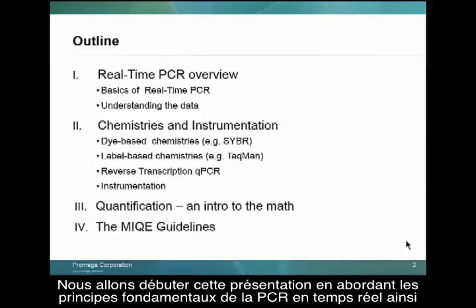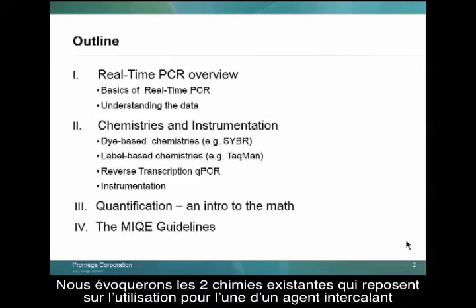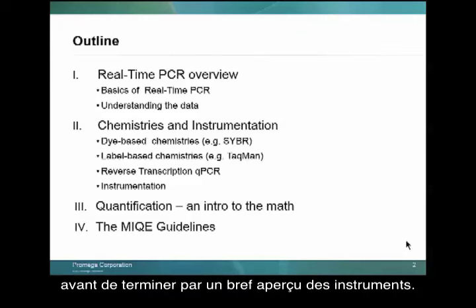In today's talk, we'll start with an overview of real-time PCR, some of the basics of real-time PCR, as well as a look at the data. In the second half of the talk, we'll talk more about the chemistries and instrumentation involved in real-time PCR, and we'll spend some time discussing dye-based chemistries like SYBR Green and label-based chemistries like TaqMan. We'll also touch briefly on using qPCR or real-time PCR to monitor RNA templates, so that would be in reverse transcription qPCR, and we'll look briefly at the instrumentation.